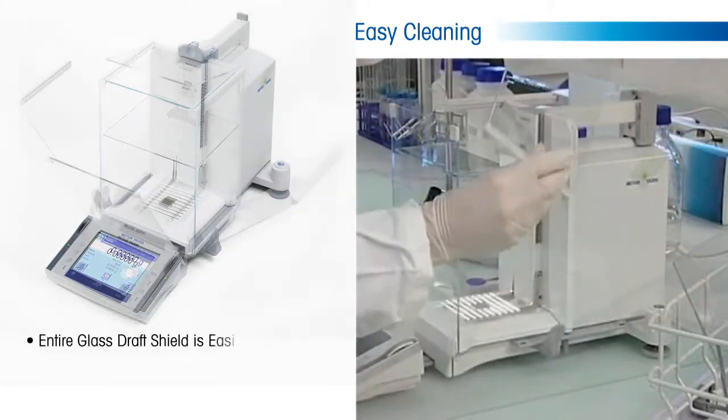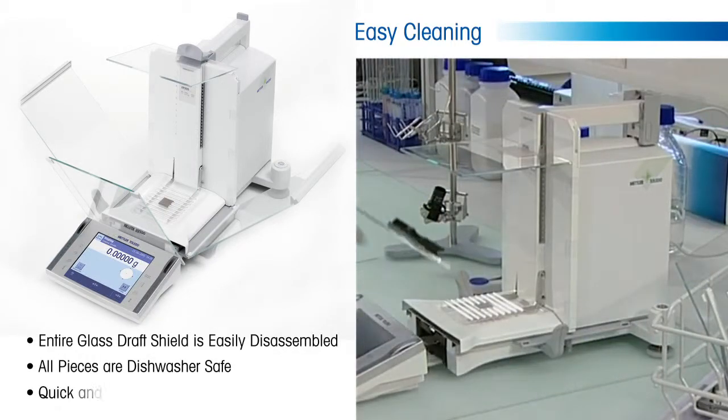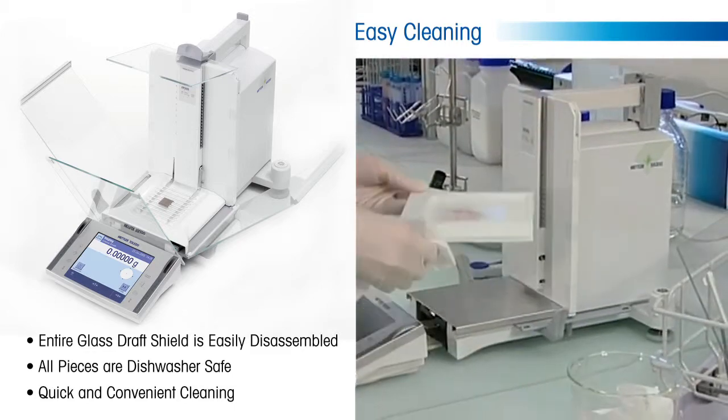In addition, the entire glass draft shield is easily disassembled and all pieces are dishwasher safe for the ultimate in quick and convenient cleaning.